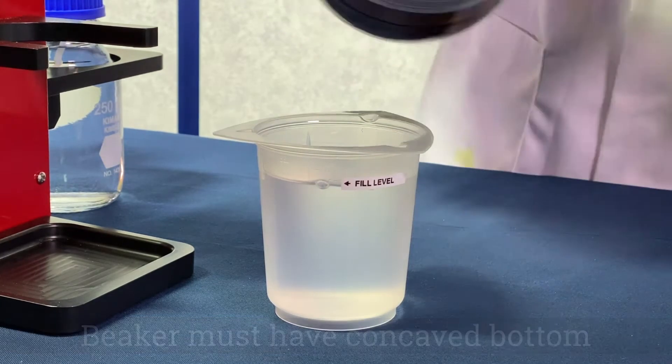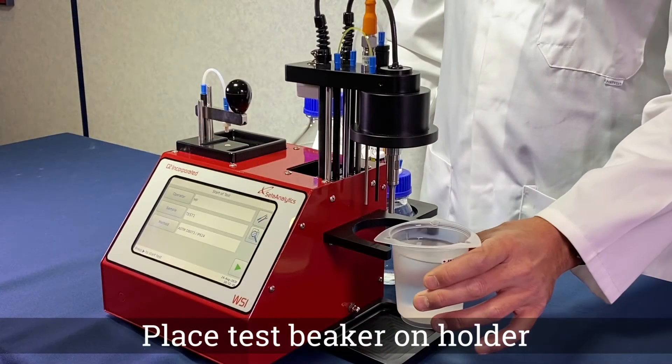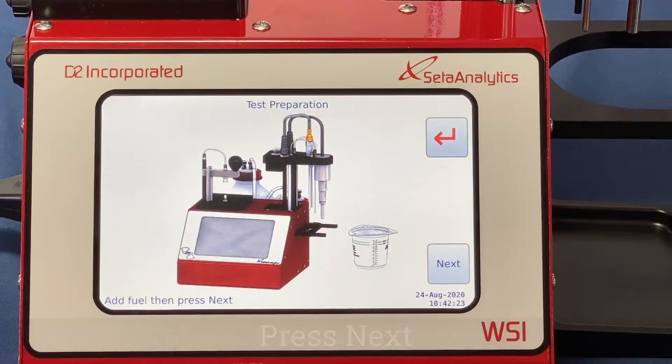In accordance with the test method, the beaker must have a concave bottom. Place the test beaker on the sample holder and press next.